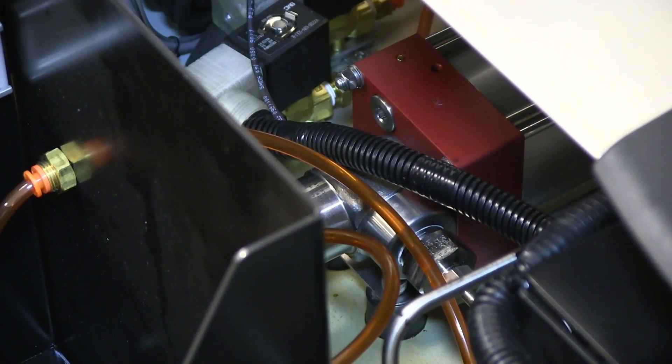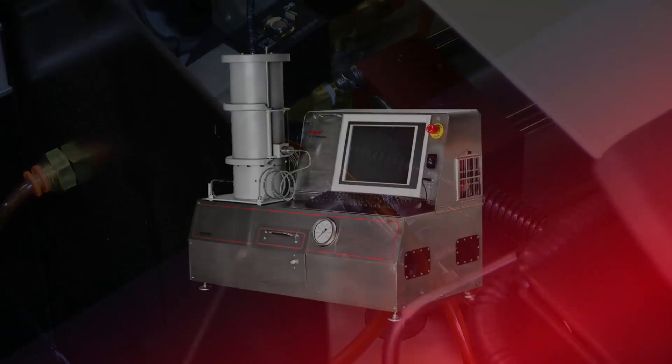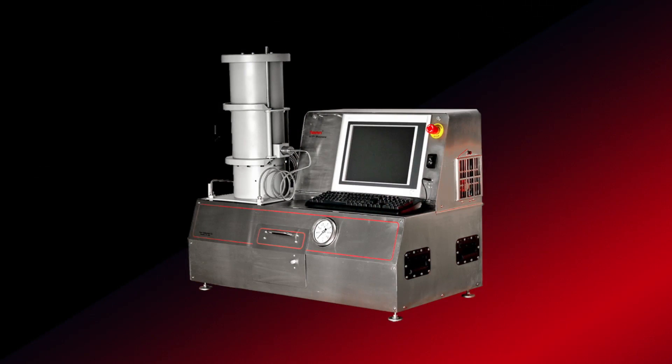The IX-77 rheometer is fully automated. User-friendly software helps the operator set up the test parameters and determine output types and timing.